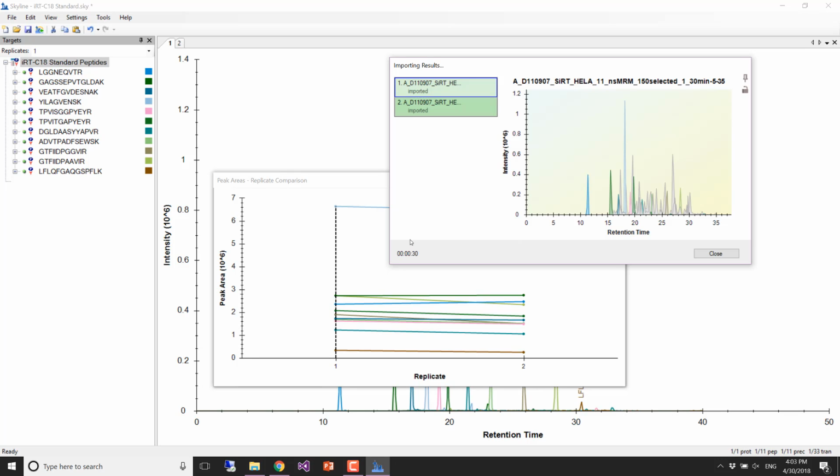Anybody else done? Okay, so who had less than 30 seconds? Yeah, how fast? It just finished 30 seconds? Did anybody else have theirs pinned so that they can see? Mine has a little timer here. Maybe, in order to see that, you have to push this push pin down, and then it will stay up.